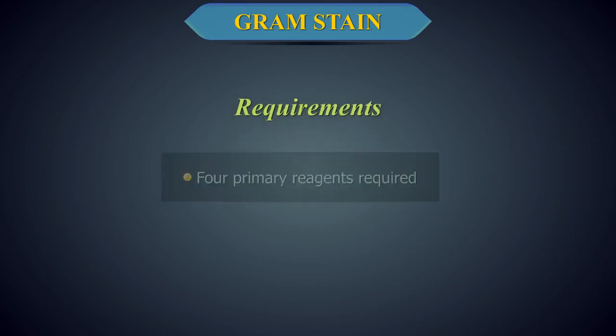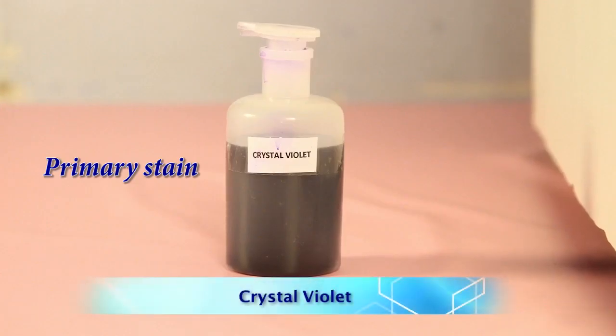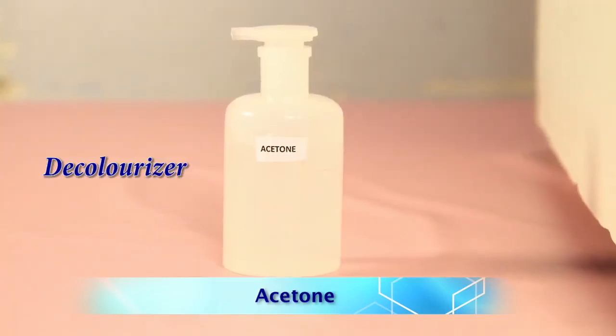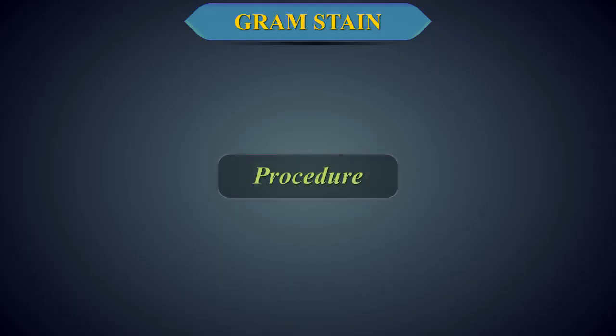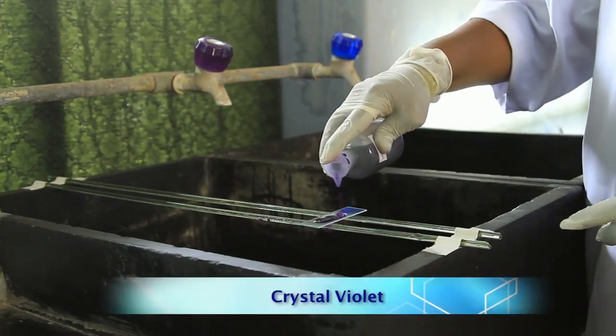Requirements: the 4 primary reagents required for performing Gram staining are crystal violet, which acts as the primary stain, Gram's iodine, which acts as the mordant, 95% ethyl alcohol or acetone, which acts as a decolorizer, and safranin, which is the secondary stain or the counterstain. Staining rack or rods. Procedure: place slide with heat-fixed smear on staining tray.